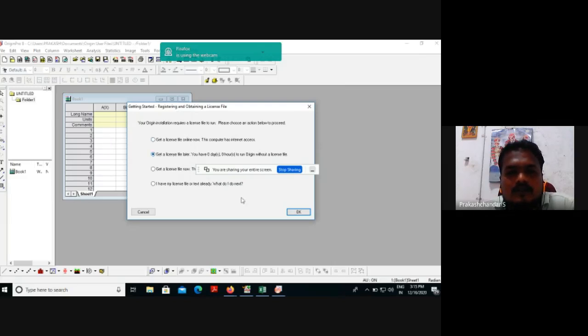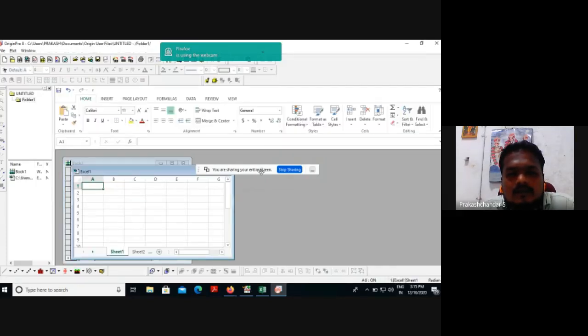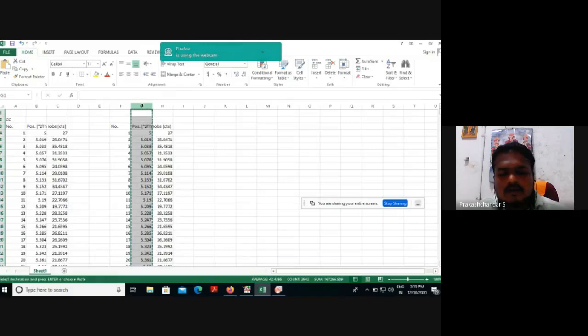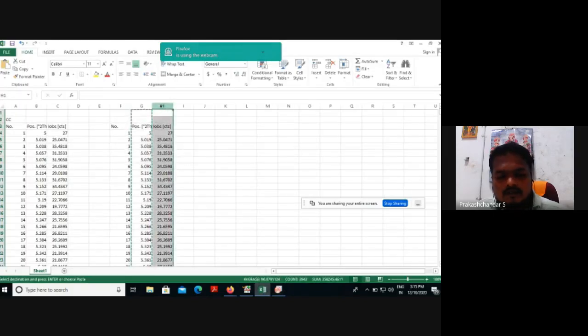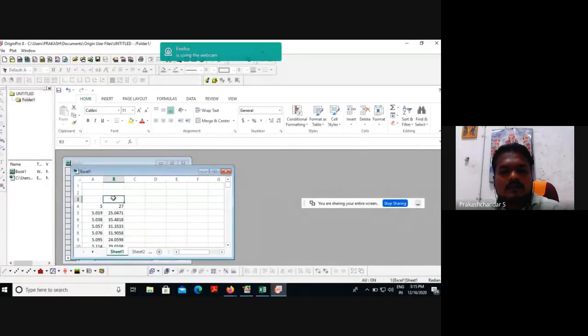Now take the Excel values. You already have those Excel values. Control C. Delete these two things.